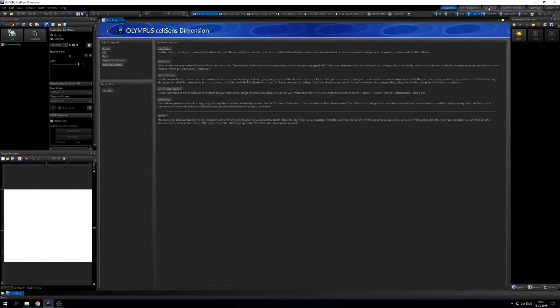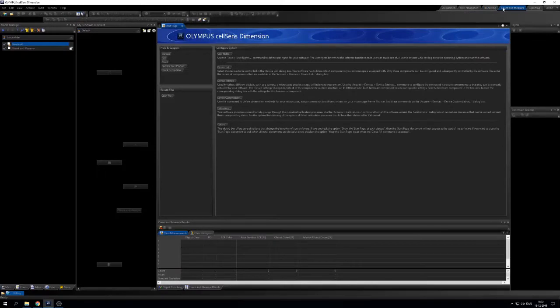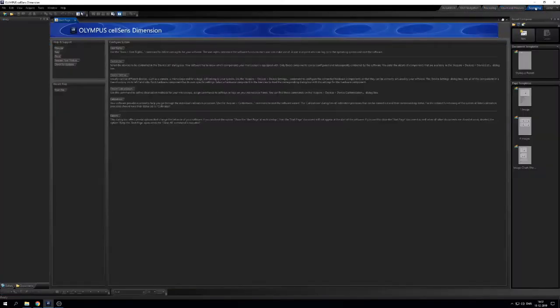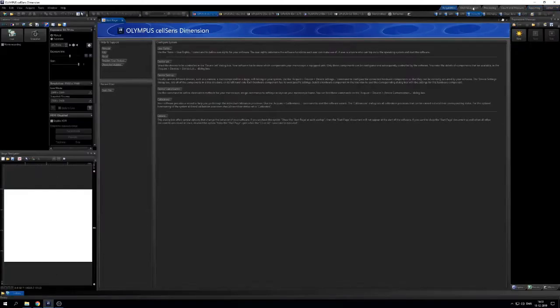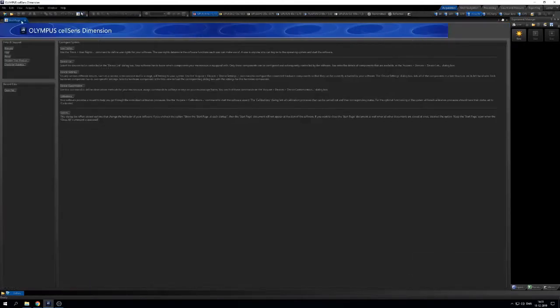And we are in the top panel. Acquisition is the main part of this video. Processing and count and measure are things you do after acquiring, and then there is a reporting function. In the upper right part you can go in and see the layout functions, simply a way of displaying the software.